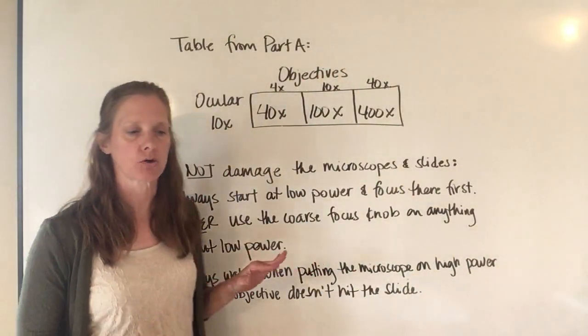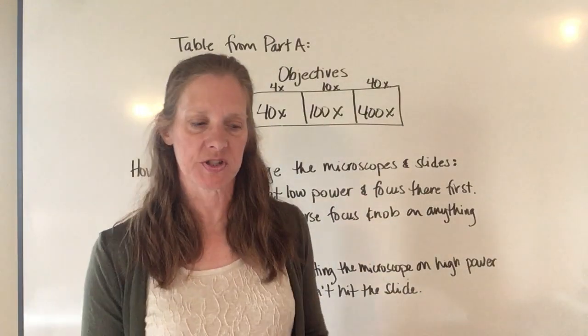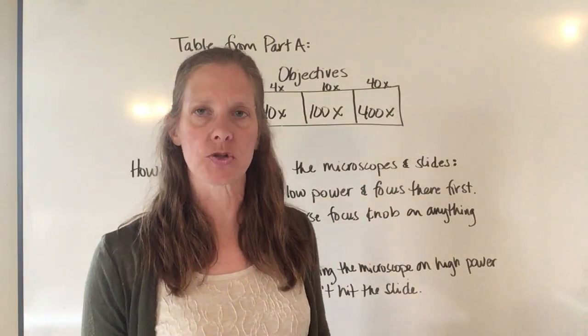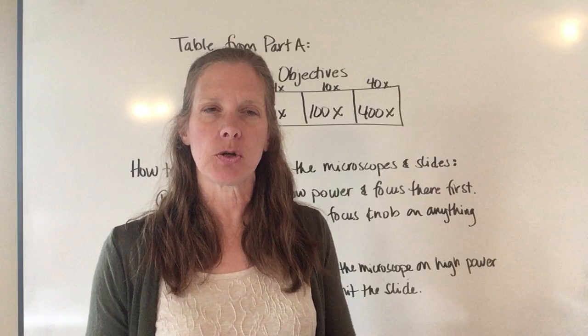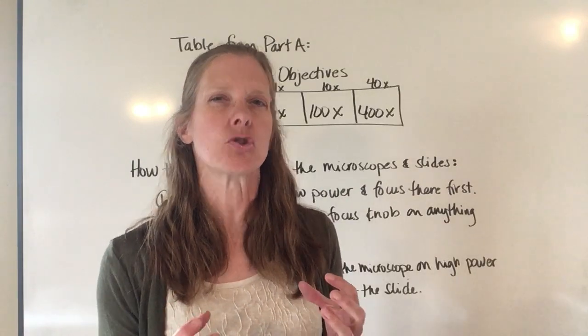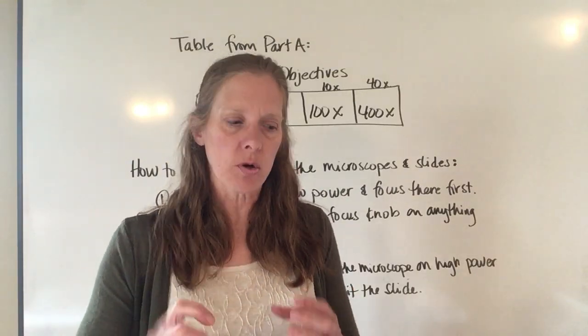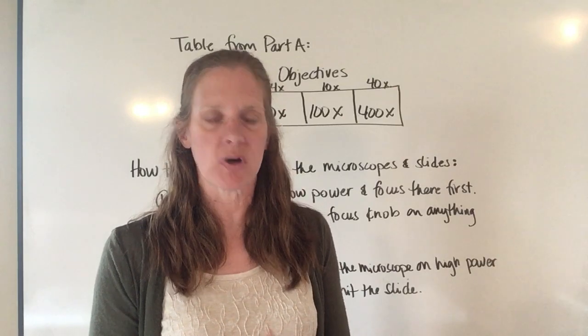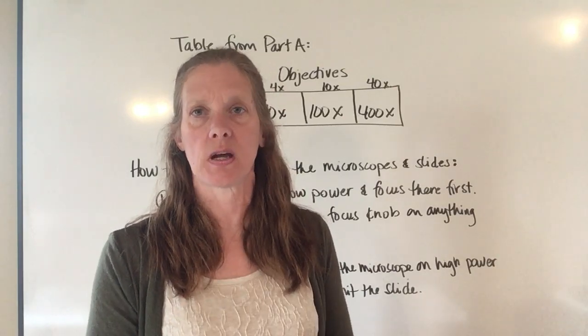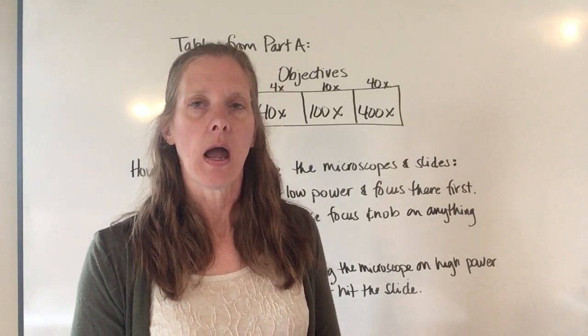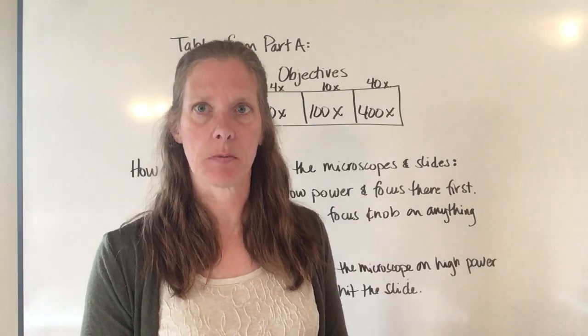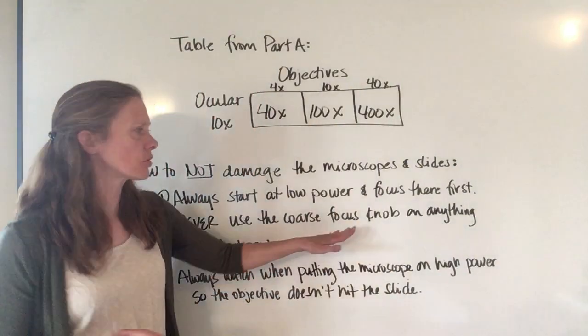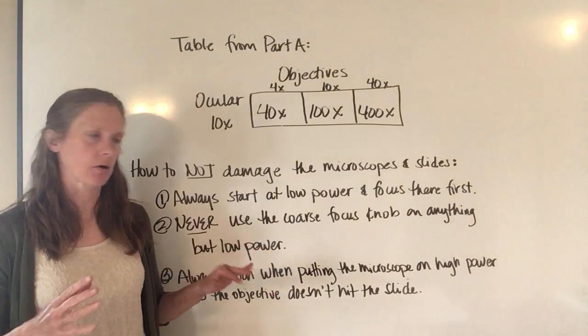When using the coarse focus, only do that on low power. Don't ever turn that coarse focus knob when you get to higher powers. Otherwise you hear this sickening crunch and realize you've lowered the objective into the slide, crunched the slide, and might have crunched the objective lens, which is not cool. Only use the coarse focus knob on low power.